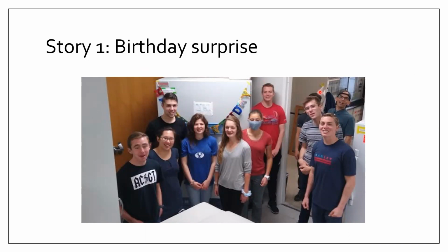Yes, it was a good surprise, and it just tells you how important the -80 and sample storage are. After that day, he immediately ordered the second -80 that is in our wet lab, the green one that you see. We really want to keep our samples safe.